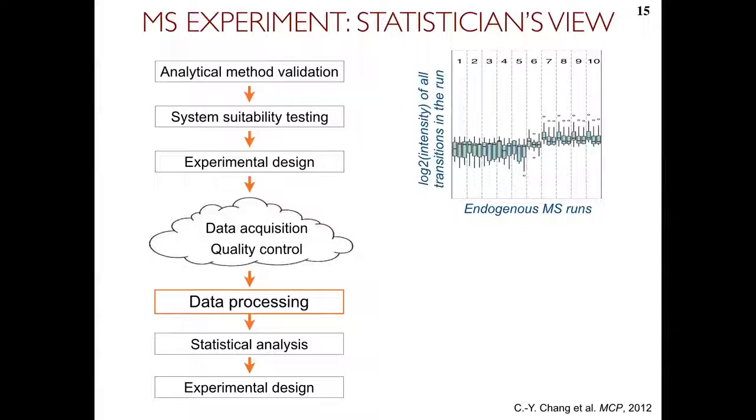Okay. And then after that, we would take a look at the data, do data visualization and data processing. A very important aspect of data processing is normalization. And I would argue that most of the time that we spend when working with new data sets is figuring out the normalization, because it is not obvious at all. Let me just give you some examples.